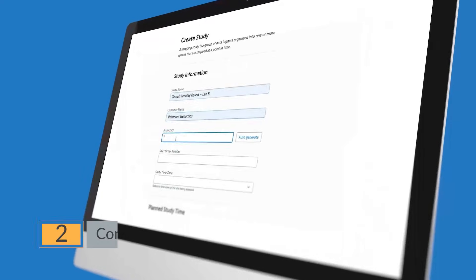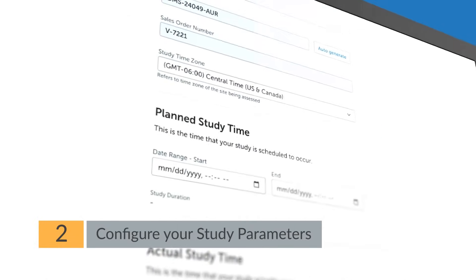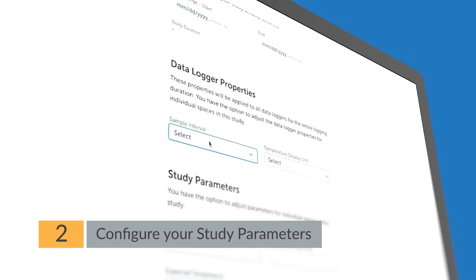Step 2: Configure study parameters. Set the duration, start time, monitoring intervals, and any custom parameters you need.